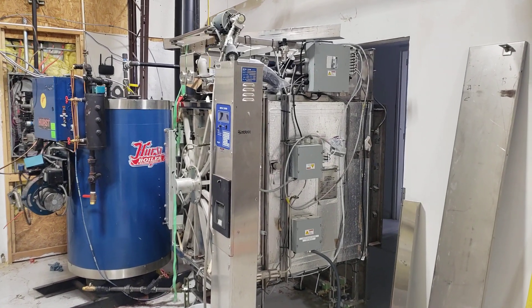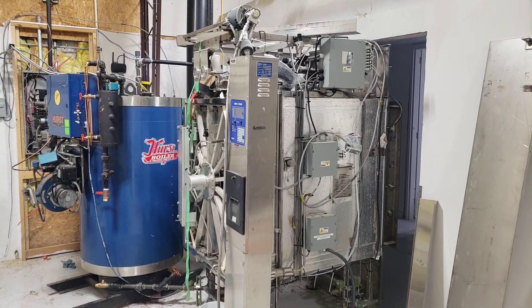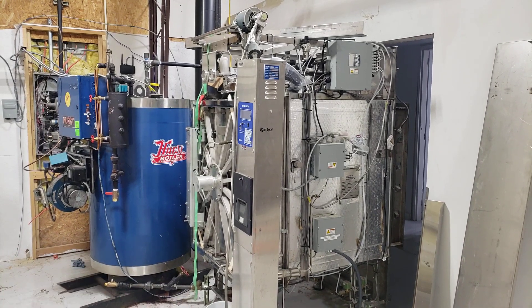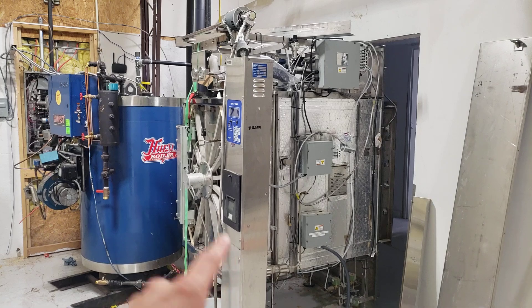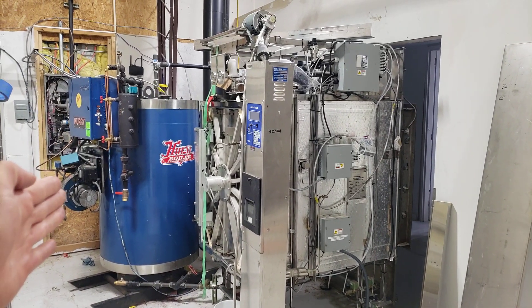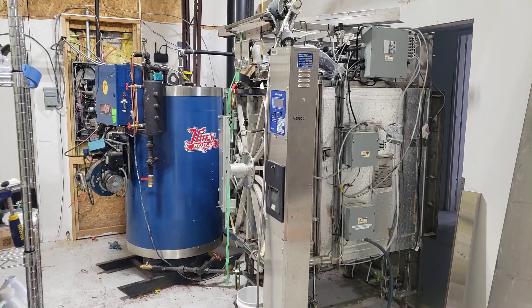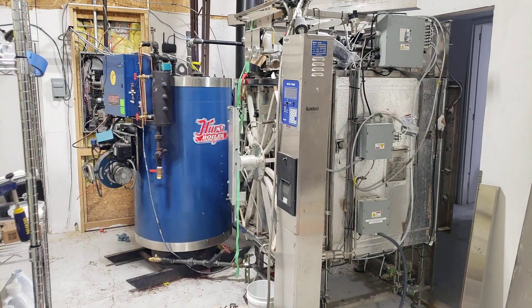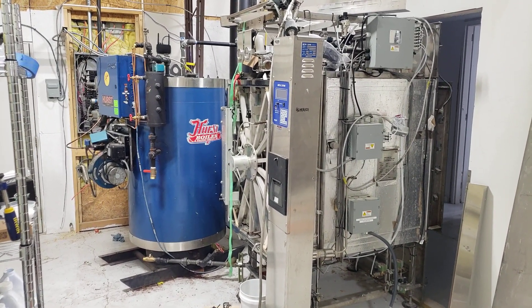Once you have a boiler and an autoclave, you have to match them. This boiler is a little oversized for this autoclave — it called for a 300K BTU boiler and I'm pushing about 550,000 BTUs, so I have a little extra. That's okay — I can use it for other things as well. Once you have your pair, you're going to want to start the install.